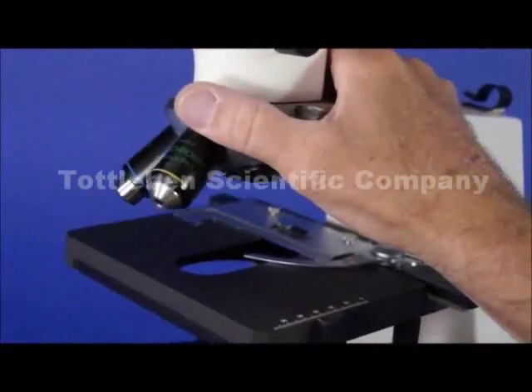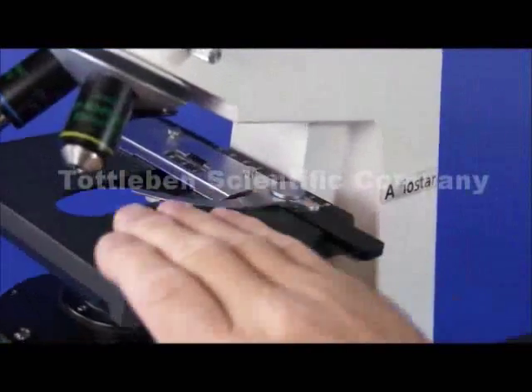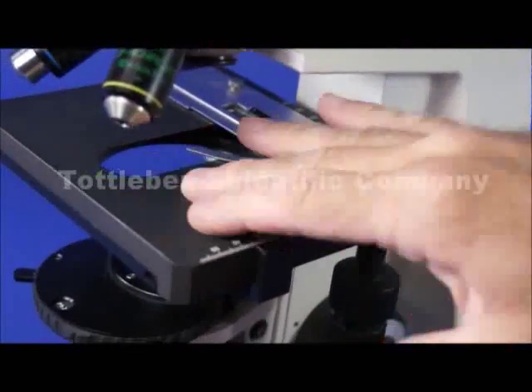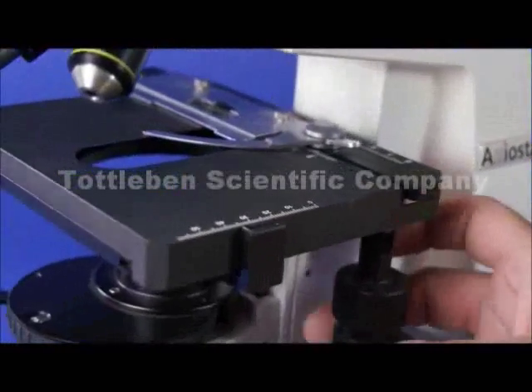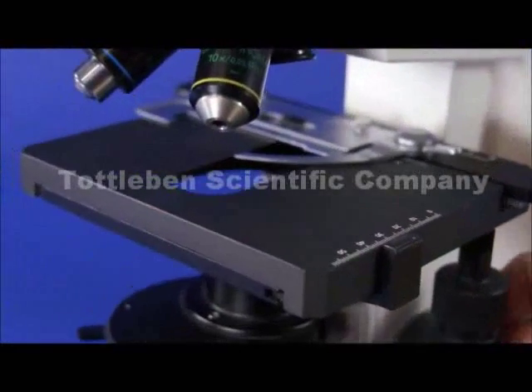Going down to the stage. This is a ceramic stage. It is not a metal stage which means it's going to last for an indefinite period of time. It doesn't scratch easily. It doesn't dent or break. Metal stages wear out. Ceramic stages do not wear out.